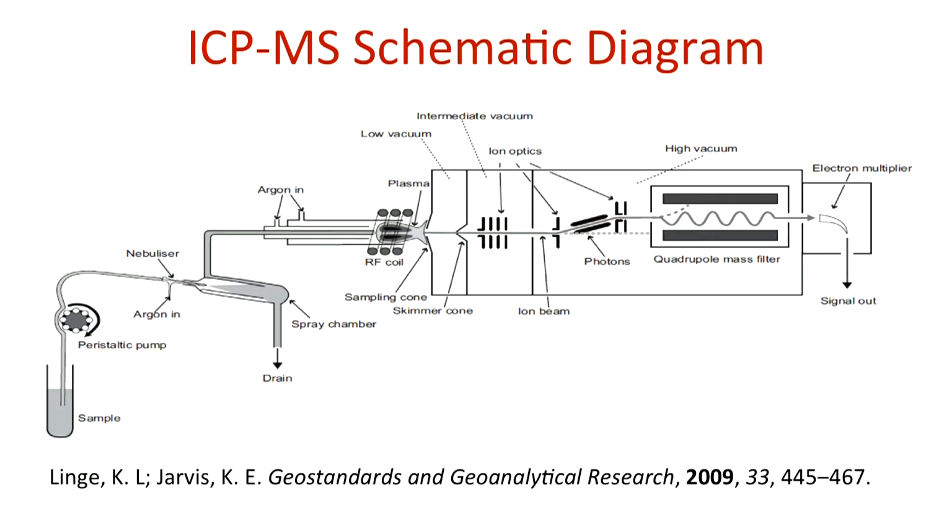In the plasma region, once again, your sample is desolvated, dissociated into atoms, and ionized, and then it goes to an interface or mass transfer line, and only the ions pass through the ion optics, and the ion optics guides these ions through the mass spectrometer for separation, and lastly to the electron multiplier detector.